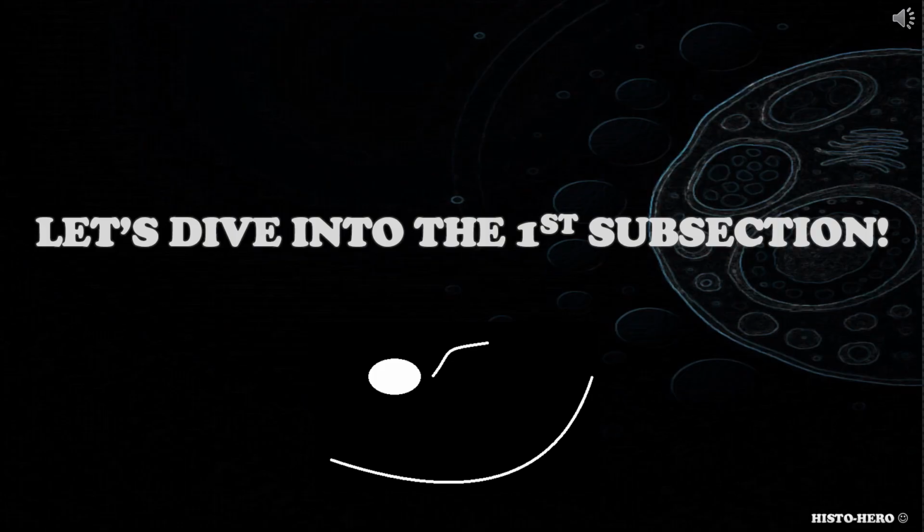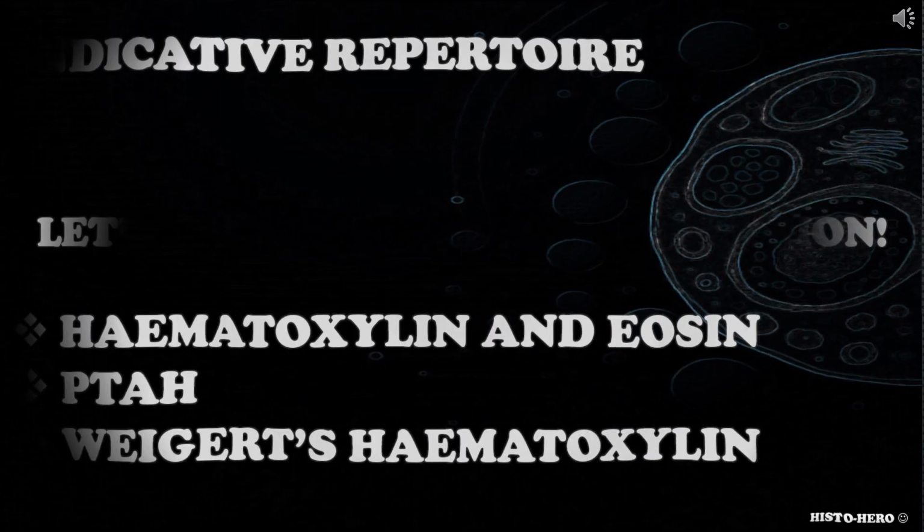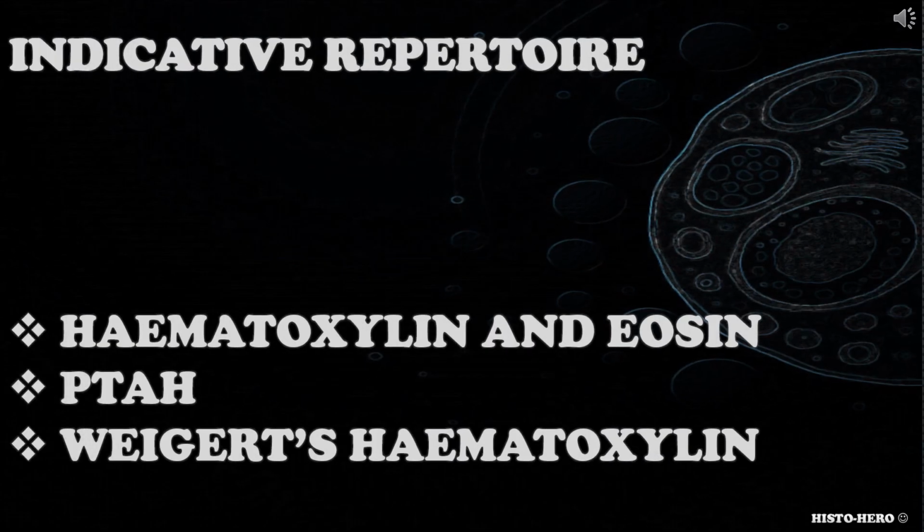So let's dive into the first subsection of the second section, demonstration techniques, called haematoxylin staining with and without eosin staining. The portfolio offers indicative repertoire for this subsection that includes haematoxylin and eosin, PTAH or phosphotungstic acid haematoxylin, and Weigert's haematoxylin.